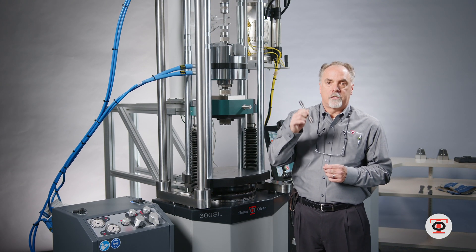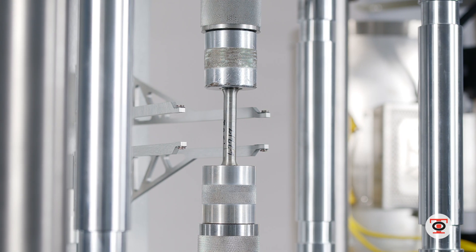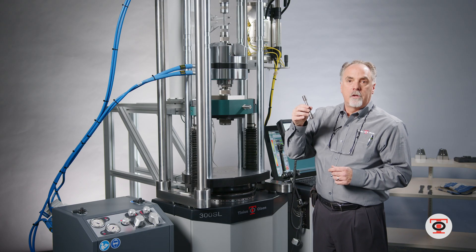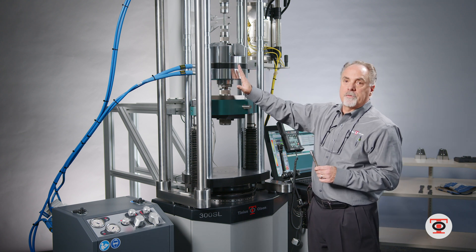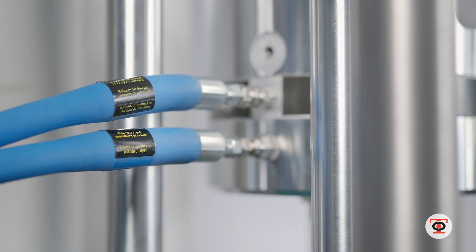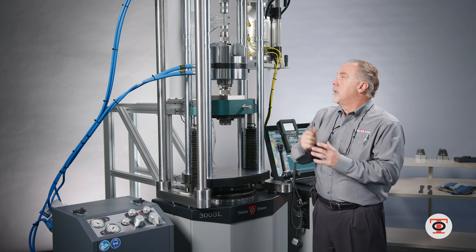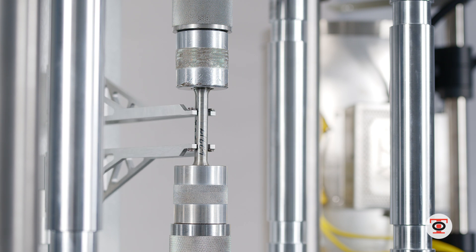This test is going to be testing a threaded round bar similar to this. Right now I have a sacrificial stud in place with a threaded adapter which threads onto the threaded specimen — not having to take the grips out to put a round holder in. I'm using the hydraulic grip with a sacrificial stud insert, I grab the stud, put my specimen in, and set up my automatic extensometer to the correct height.